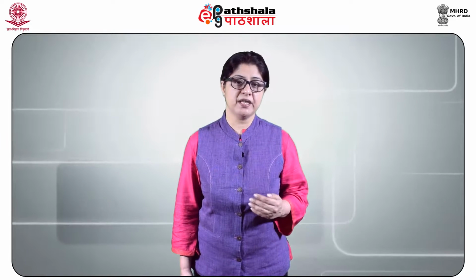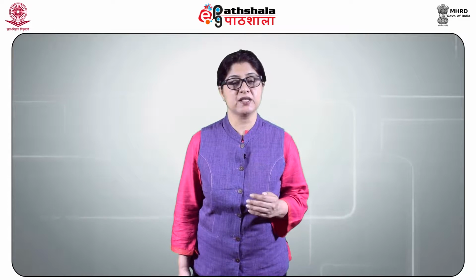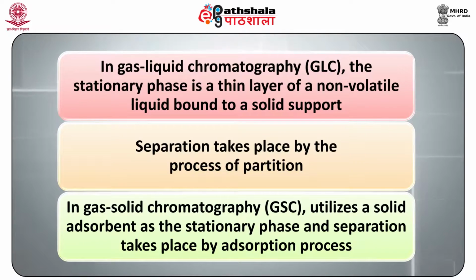Gas chromatography is similar to column chromatography, except that a gas is used as a mobile phase instead of a liquid. In gas liquid chromatography, which is GLC, the stationary phase is a thin layer of non-volatile liquid bound to a solid support. Separation takes place by the process of partition.